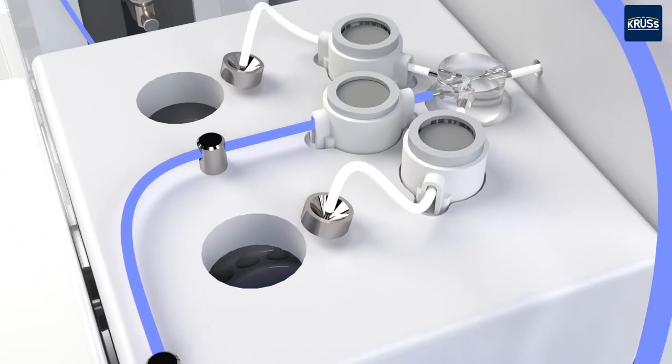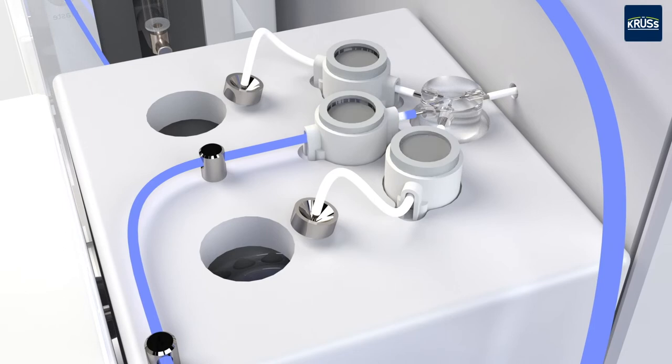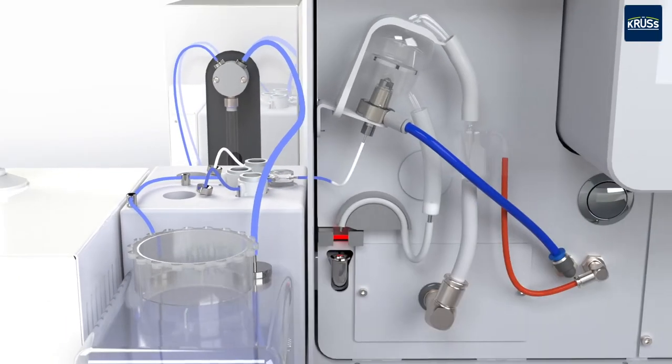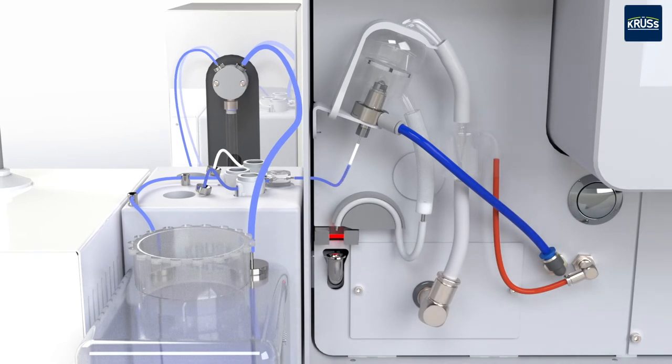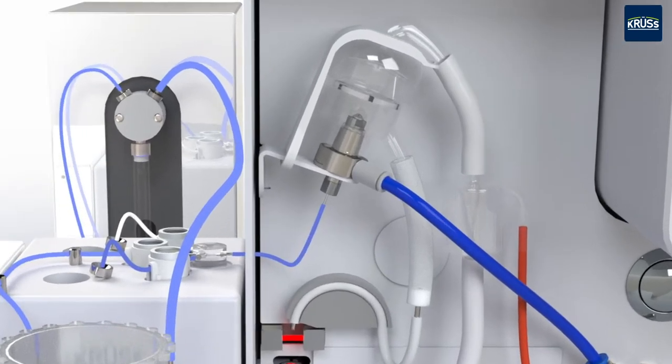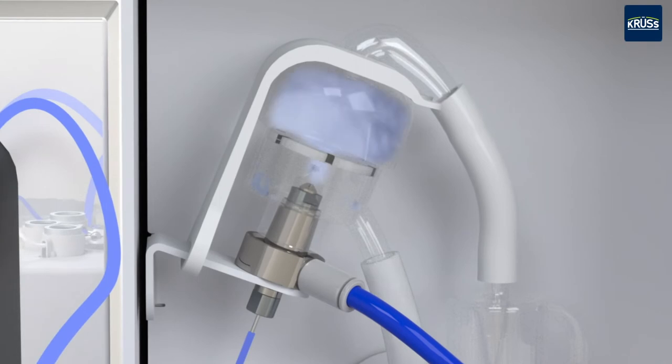In the next step, magnetic valves are opened which transfer the diluted sample into the AES where the measurement occurs. The diluted sample is aspirated into the nebulizer by the venturi effect and nebulized into very small droplets.